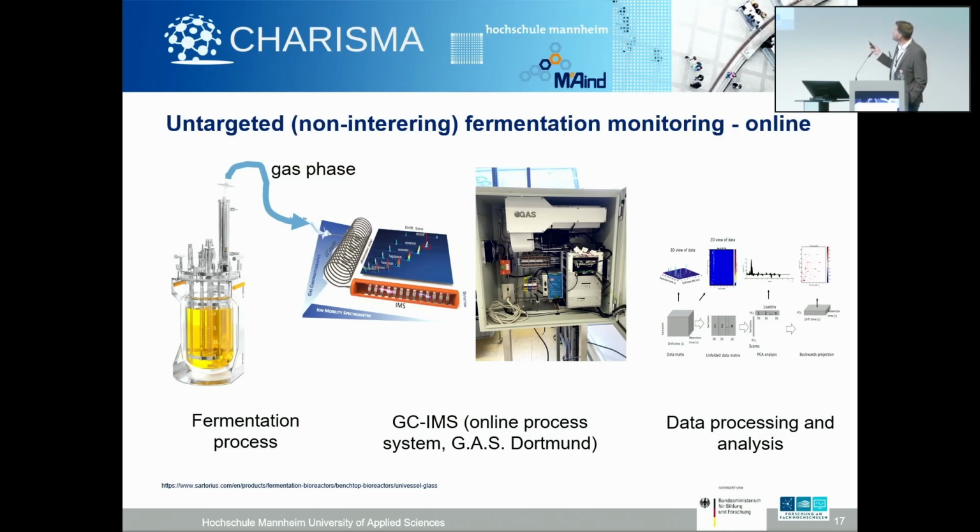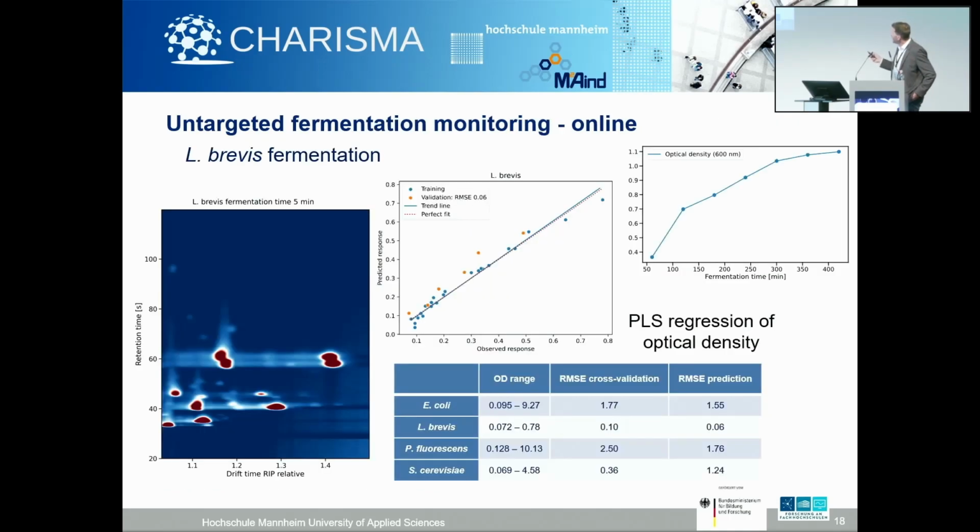And we're having near real-time or near online measurements. Near real-time means between 2 and 5 minutes. So that's fast enough for fermentation processes. For a roasting process, it's a different world. And if you put your attention here, that should run now.